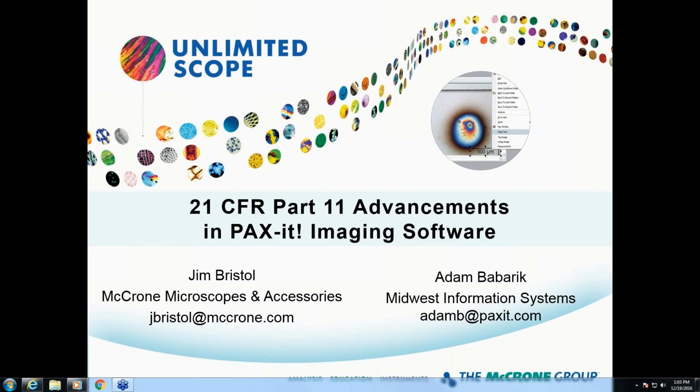Adam is a software engineer and product manager for Midwest Information Systems, the maker of PAXit, with more than 10 years of experience in imaging software development. Adam has been the main force behind MIS's development of this 21 CFR Part 11 software package.